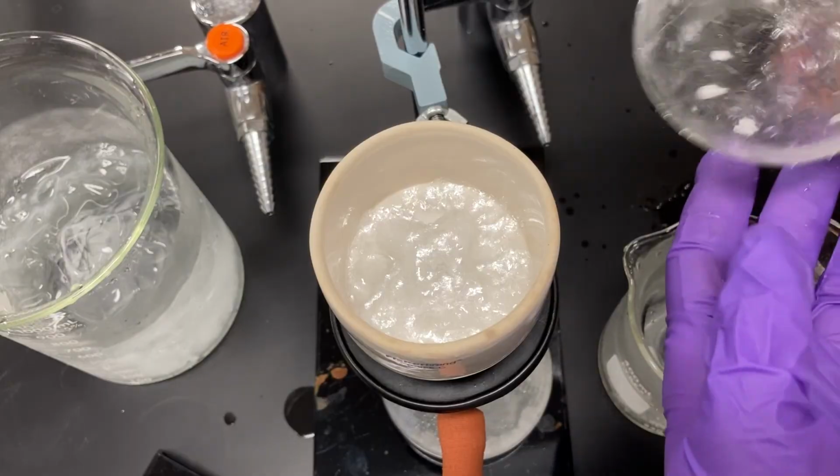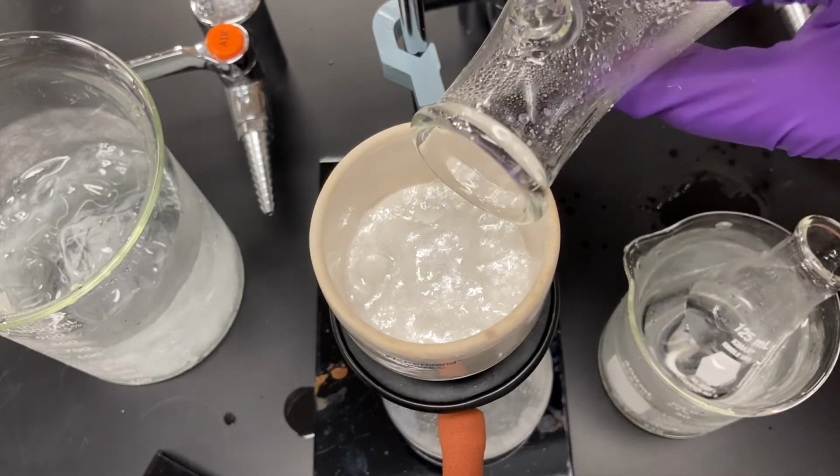Use some DI water to wash more crystals out of the flask.